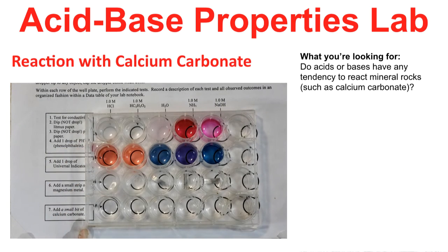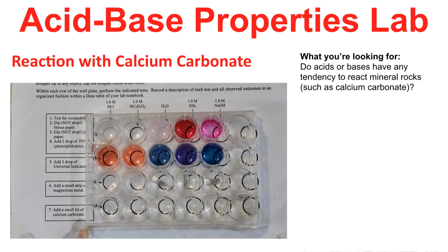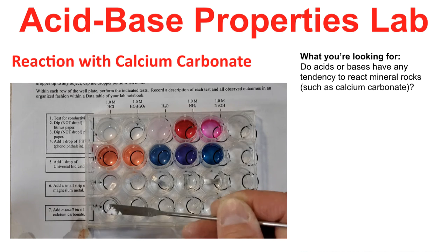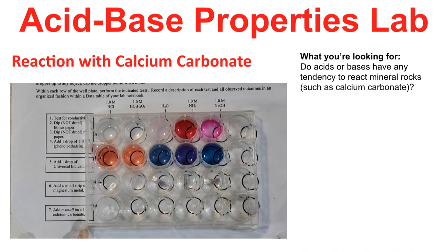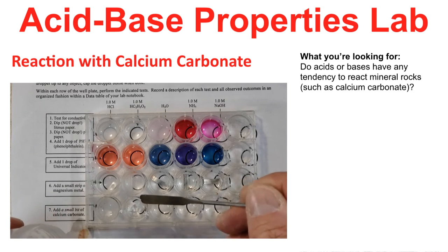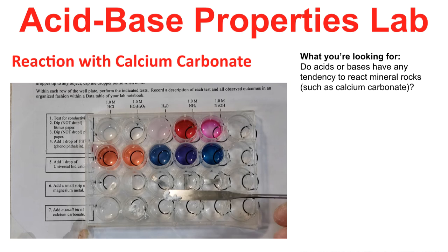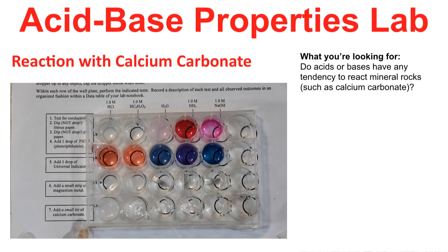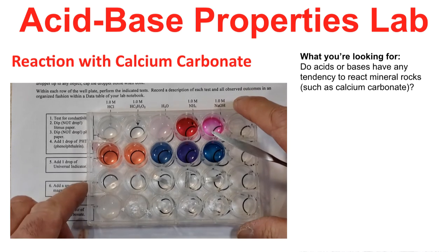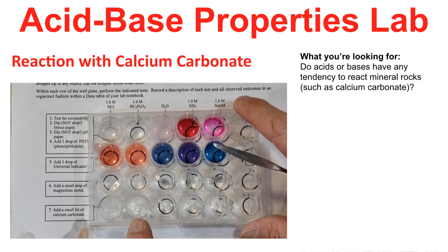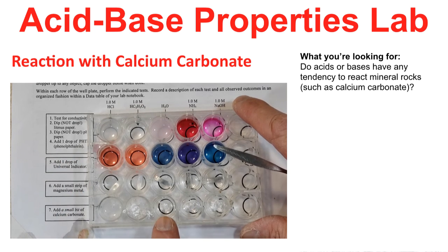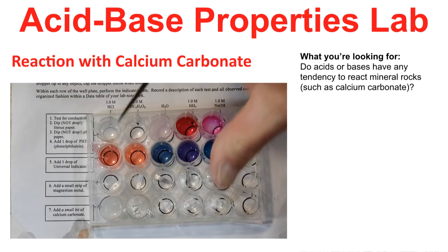Calcium carbonate is a primary constituent of limestone rock, often mined and used in building materials such as marble statues. Limestone also forms the foundation of many lakes and riverbeds. We're going to see how calcium carbonate reacts with acids and bases. We see a rather vigorous reaction with the strong acid, a milder reaction with the weaker acid, no reaction with water, no reaction with the bases, and no reaction with the strong base. Record your observations — there are two significant wells in which we have a reaction.